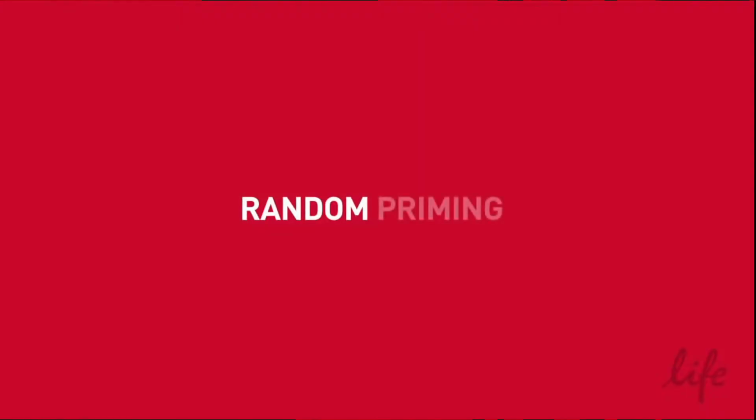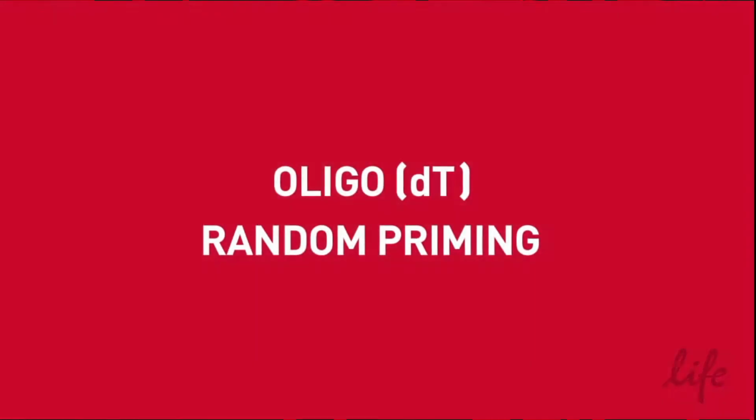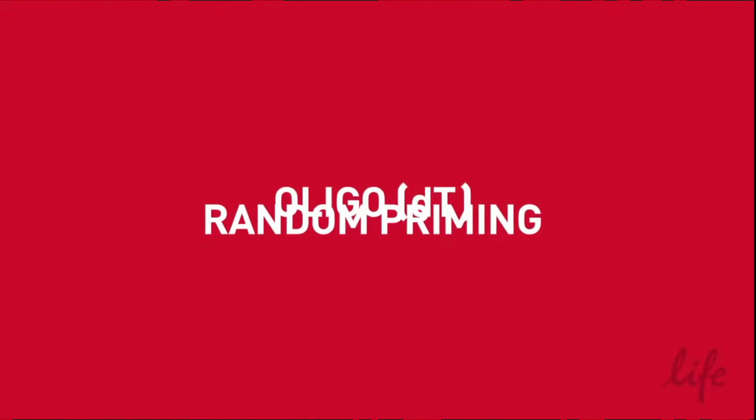An alternative is random primers, which are randomized hexamers or nonamers. These primers will bind all along the RNA transcript and so help to overcome issues with secondary structure and give a good representation of the population. Random primers usually result in higher cDNA yields. Some researchers choose to use a blend of both random primers and oligo-dT to get the benefits of both options.